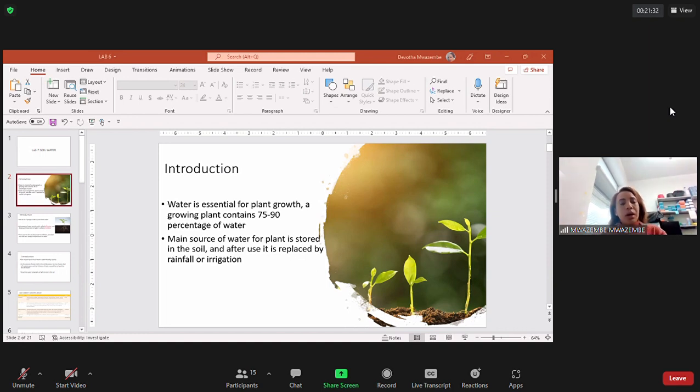Now on step number one, what you have to do is make a ring. When you say a ring, this is how it's made. You take the core and the filter paper and the rubber band, and you tie the rubber band like this and you make something like a ball, and we call that a ring. So a ring is basically the brass core with the filter paper and elastic band all together. Are we together on step number one?